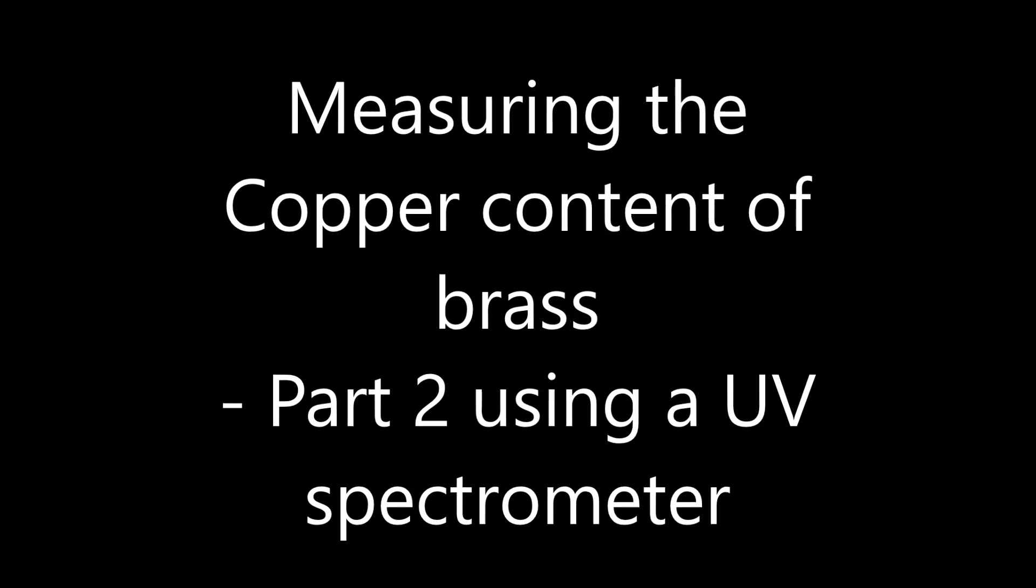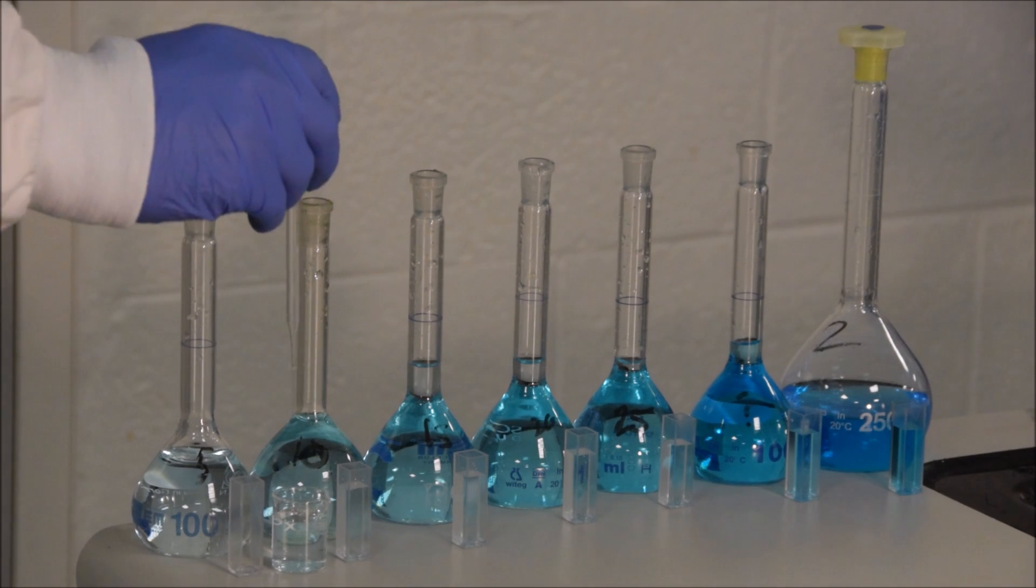Okay, so now we're going to learn to use the UV spectrometer. The first thing we need to do is prepare our samples.